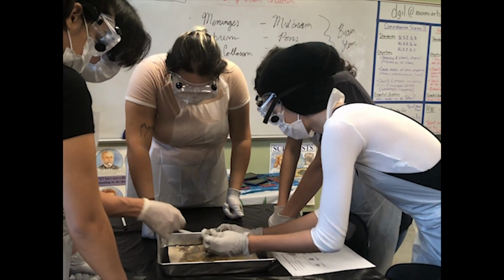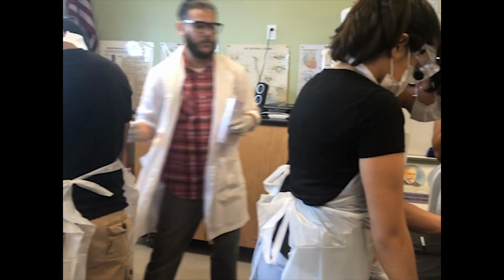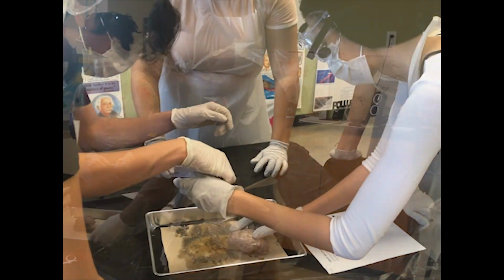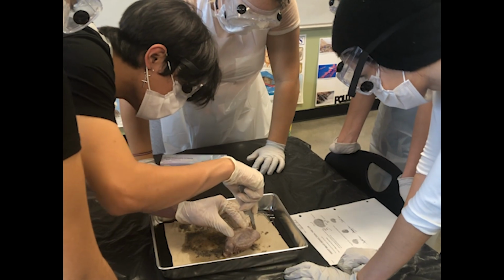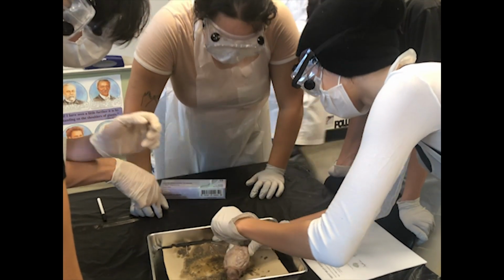That is the longitudinal fissure, and you are going to start from the anterior. Start from here. Here, I'll show you. You have to do it like this, and then like this. You know what I mean? You have to get in there with the whole knife and then cut it with the tip.